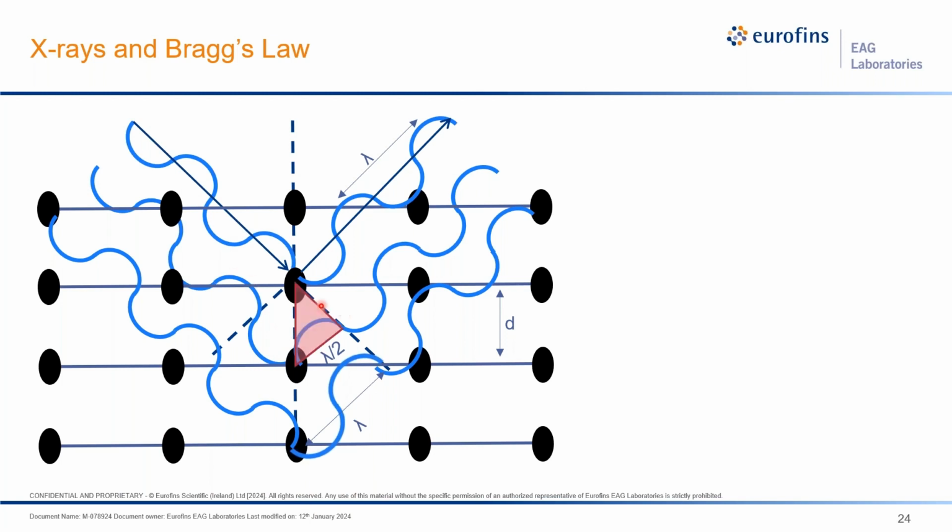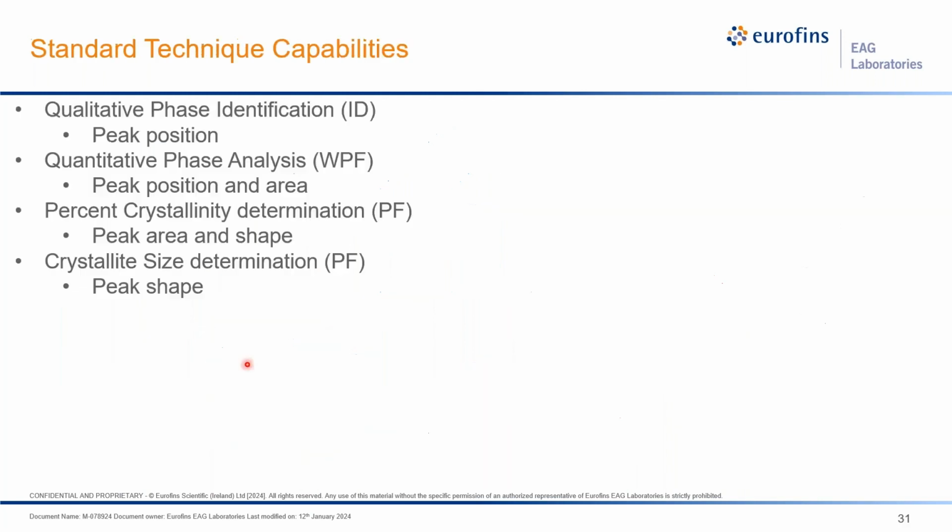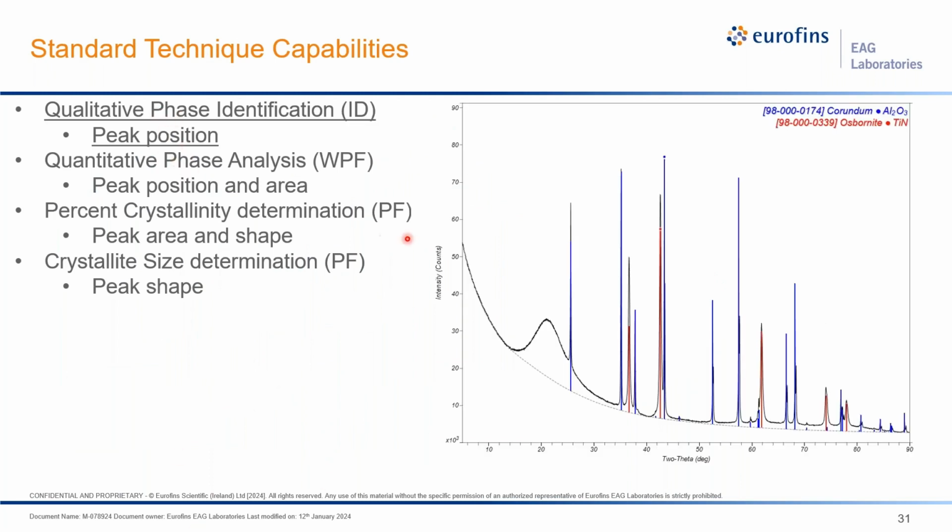And what that means is that we can draw this triangle here and go back to our wonderful trigonometry from high school. And we call this angle theta. So this angle here is 2 theta. And with a little bit of SOHCAHTOA, we can work out this nλ = 2d sin θ, which is Bragg's law. So what that means is that if you have a repeating structure, you will satisfy these diffracting conditions. And these diffracting conditions are what give you the peaks in an XRD spectrum. And really, that's the bread and butter of materials identification, the phase identification of crystalline materials.